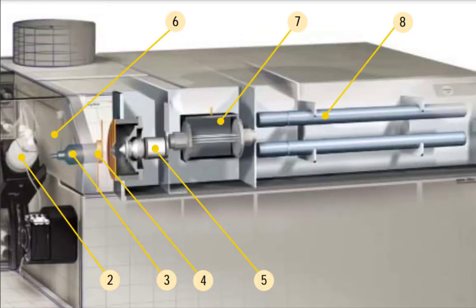We're kind of going to ignore the sample introduction part of the system because it's very complex and there's a lot of different options out there. So there's laser ablation and liquids introduction, so for solids or liquid samples, but there's also different types of liquid introduction like organics or things with HF that require inert things or things with high total dissolved solids. So we're just going to skip this number 2 section on the diagram here.